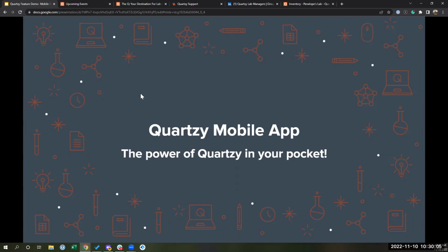And I'll jump in here and say that's also an enhancement that we want to make. I know there's another comment about the min and the max thresholds. That's definitely something we want to put on the labels. And in addition to that, hopefully some more flexibility in the future on, well, I do care about part number, but maybe I don't care about the catalog, or the min max threshold or something like that. We do want to put that flexibility into the printing process at some point in the future. Absolutely.